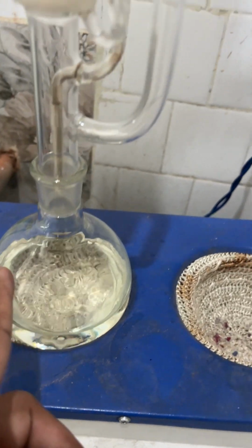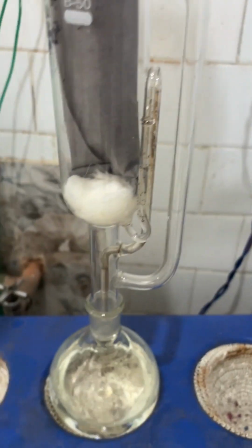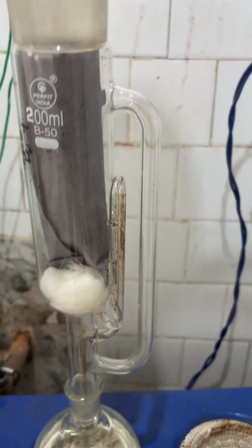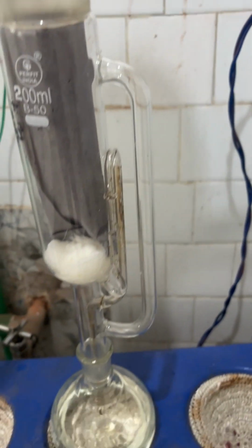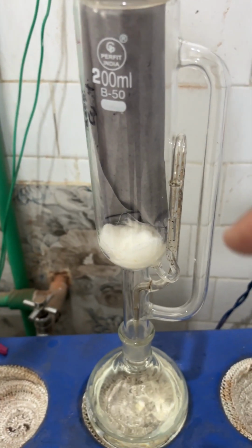Now it will again evaporate, go through this and come back, and this reflux will go on for like 1 or 2 days, and then once we find that we have enough refluxing, so maybe 72 hours, then we'll collect this solvent extract, dry it and extract our powder, and then we will use another solvent of different polarity.